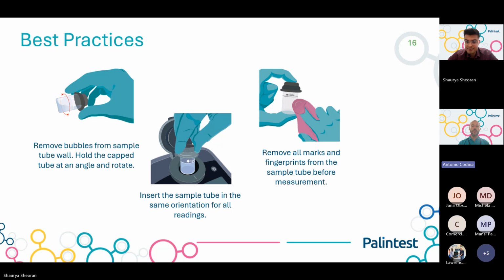Now you always want to remove all fingerprints and dry the vial very well, because if there are any droplets on the outside, they are going to affect the light as it passes through and again, it's going to affect your measurement. And then you always want to put the glassware in the same position. That's why we put a diamond printed on the glass, because if you rotate your glass, just the minimum variation in the thickness of the glass will affect the result.